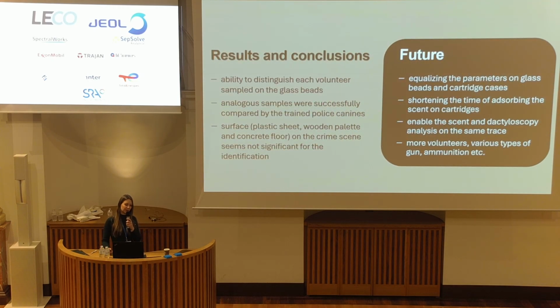And for the future, we can try to equalize the parameters on the glass beads and the unknown samples on the cartridges, meaning that we can heat the glass beads with the human scent on them to the same temperature as during the firing of the gun. Because the heat could slightly change those substances, so maybe it will equalize the parameters, and we will be able to link the unknown samples to the known samples from the volunteers.